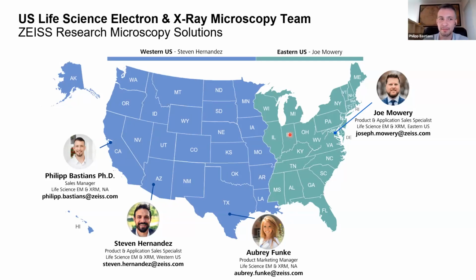That makes it, we hope, much more feasible in terms of having access to it, in terms of how fast we can scan and what kind of volumes we can acquire, while at the same time providing the researchers doing a follow-up volume EM experiment the resolution they need to trim the sample at the right location and to have that preview that I mentioned just now for any of those volume EM experiments that they are doing. I hope that gives you a little bit of an idea.